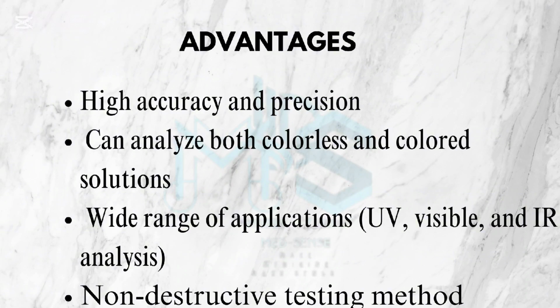Advantages of a spectrophotometer over the colorimeter. This is a question that will always come, and they can tell you compare and contrast. Now, the advantages is that the spectrophotometer will give a high accuracy result, can analyze both colorless and colored solution, wide range of application. It has a non-destructive testing method.